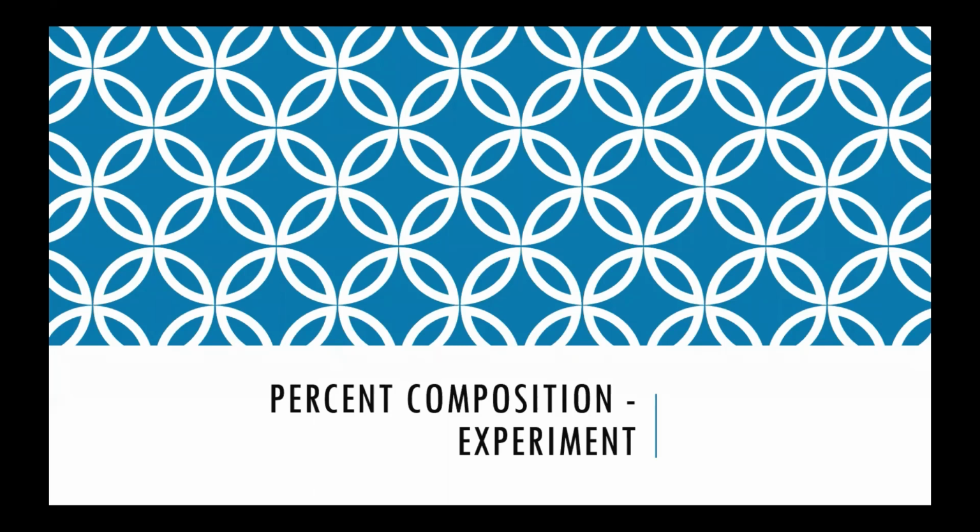While percent composition can be determined through chemical formula and molecular weights, many times, especially in a lab setting, it needs to be done experimentally through actual measurements, whether that be mass or absorbance or other different types of measurements that are performed in the lab.